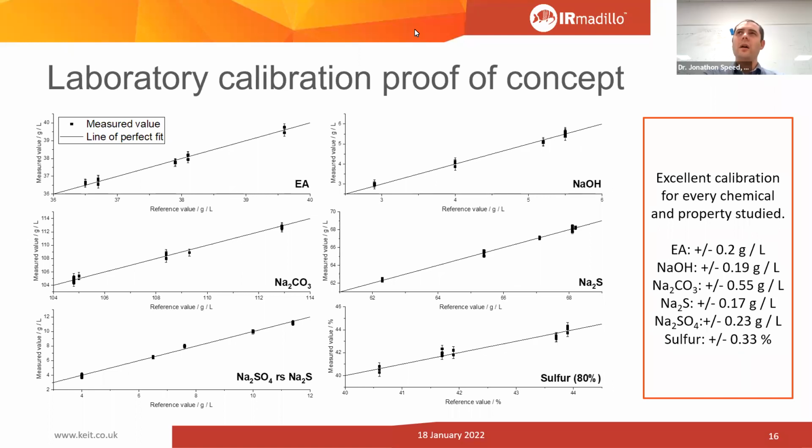That's an interesting one. An agglomeration, if it's acting like a solid particle, might be tricky to see, as I said, based on the answer about solids. If it's more like a sol gel, where it's mobile, almost like a liquid globule within a liquid stream, that might be something we could see. I don't know is the short answer.